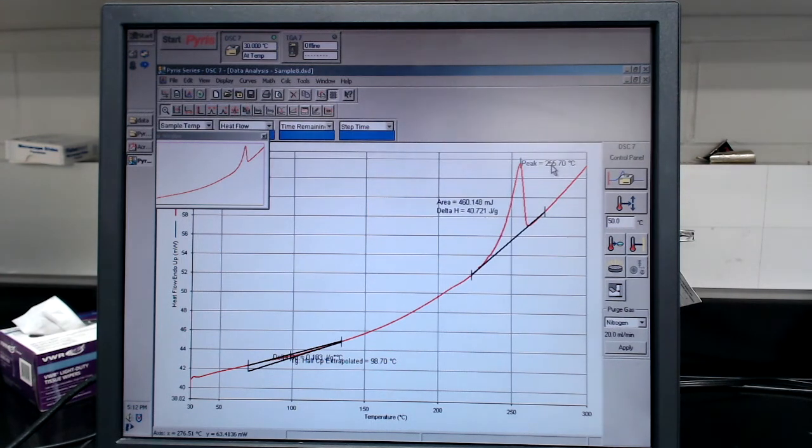If you think about all the types of endothermic events that we can have with a polymer, this will be a critical thermal event that happens in these materials. You know the temperature that it happens at, and you also know the enthalpies, and this will be useful when you identify the polymer. You can go back and calculate enthalpies, and these values should correspond to what you get for that material, and it'll help you look at things like percent crystallinity as well.